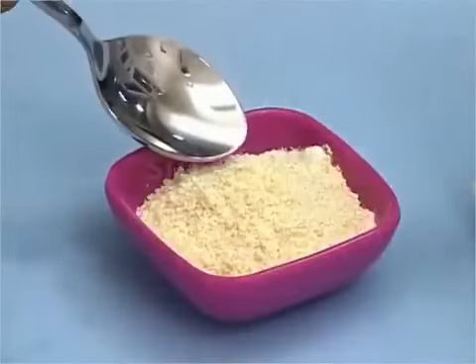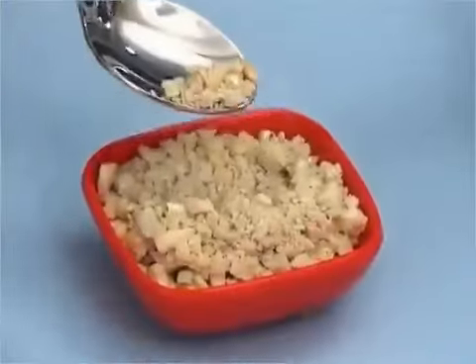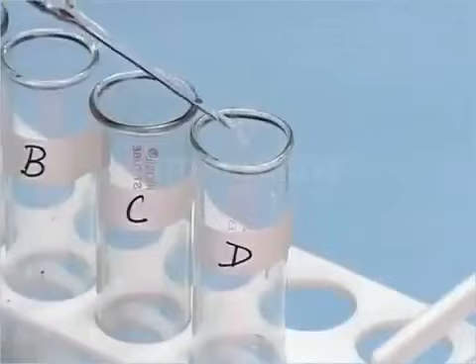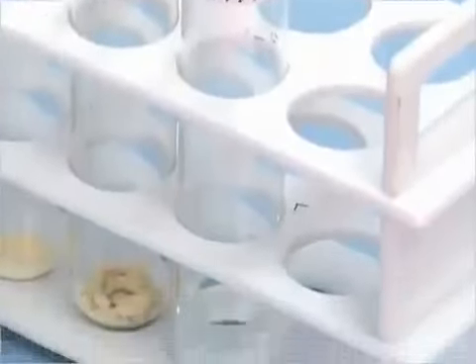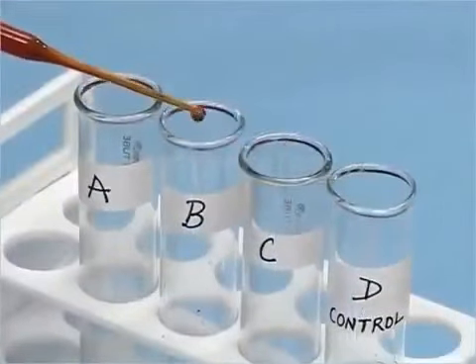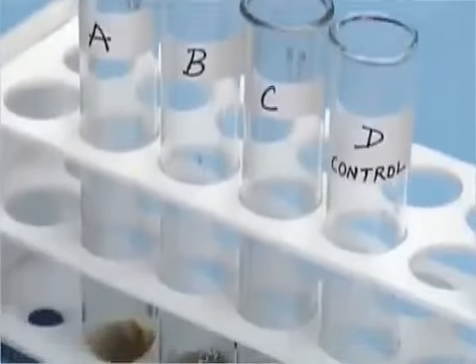Take a little quantity of powdered pulse and put it in the test tube B. In the test tube C, add a few pieces of crushed cashew nuts. In the test tube D, add a little amount of water and label this as control. With the help of a dropper, add a few drops of iodine solution in each test tube. Now wait for 1 to 2 minutes and observe.